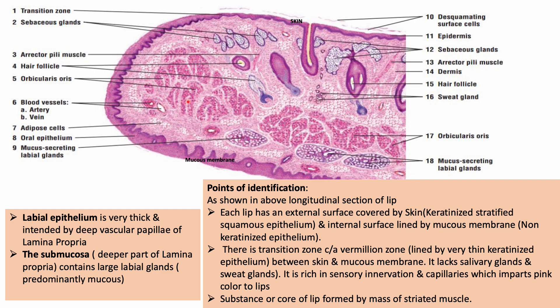Deep to the labial glands is the deep musculature, formed by the orbicularis oris muscle. The key identification points for the lip slide in longitudinal section are: the substance is formed by a mass of muscle; each lip has an external surface covered by skin and an internal surface covered by mucous membrane; and there is a transition zone between them known as the vermilion border.